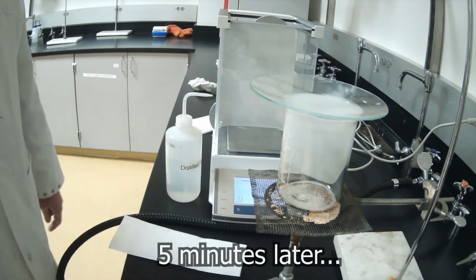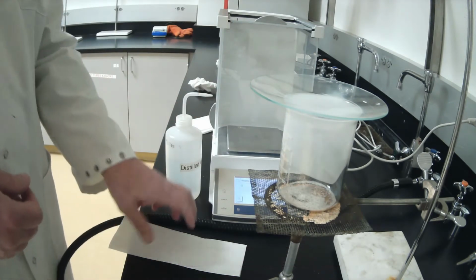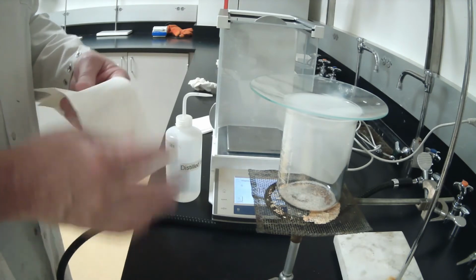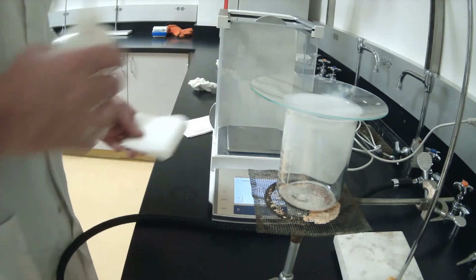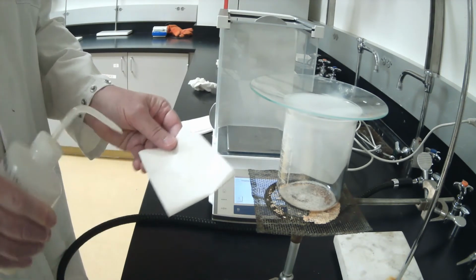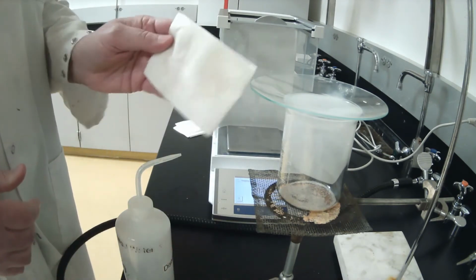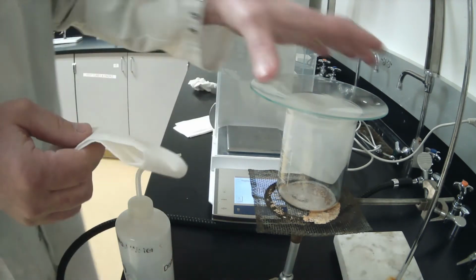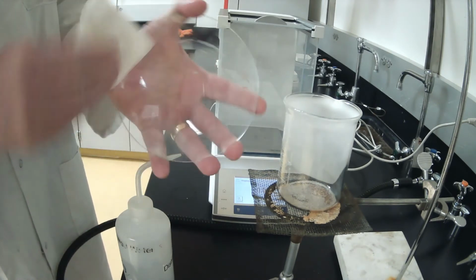Alright, we have now waited the 5 minutes to allow this beaker to cool down, so we can now try to remove the ammonium chloride. One of the nice physical properties of ammonium chloride is it's much more water soluble than any other compound. In fact, we only need a very slightly damp paper towel and the ammonium chloride will dissolve right off.